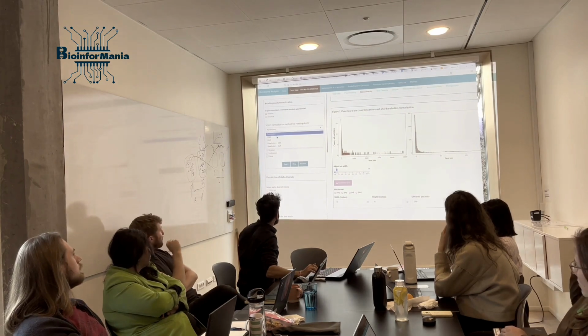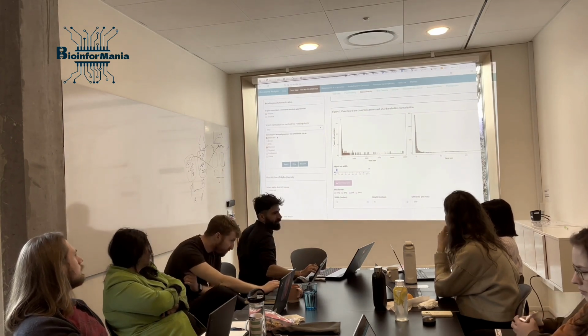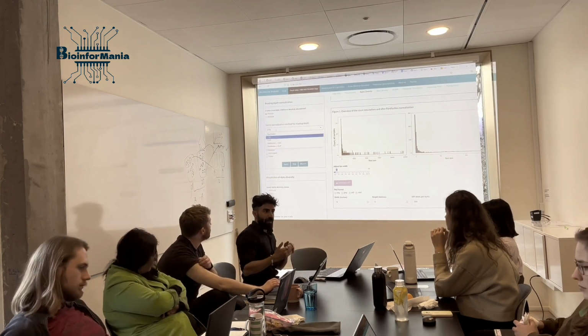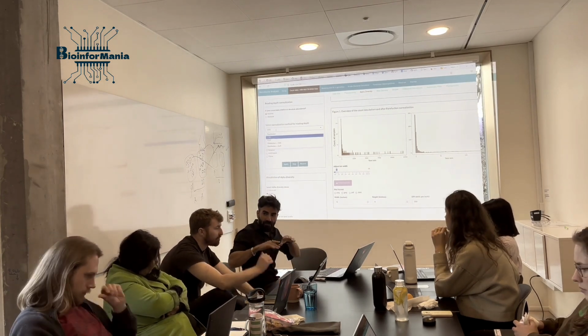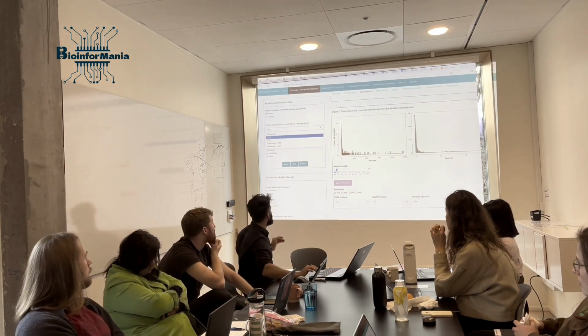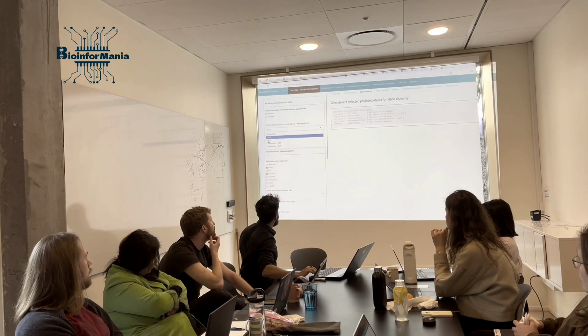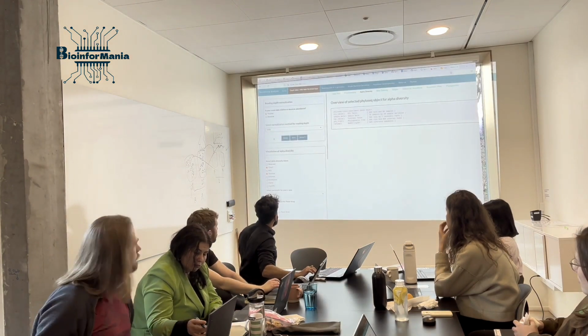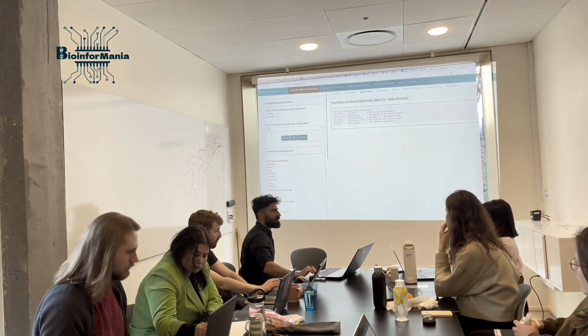Instead, we go and select cumulative sum scaling. If you want to combine it, say, okay, I want to bring all the samples to the same depth and do the cumulative sum scaling, that's probably the best, okay? Another one is centered log ratio transformation, and the combination of this with rarefaction. For this demonstration, we just select CSS.